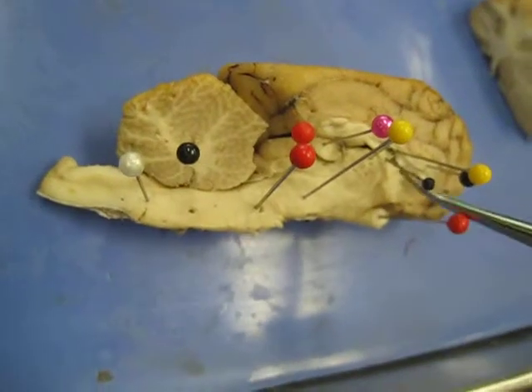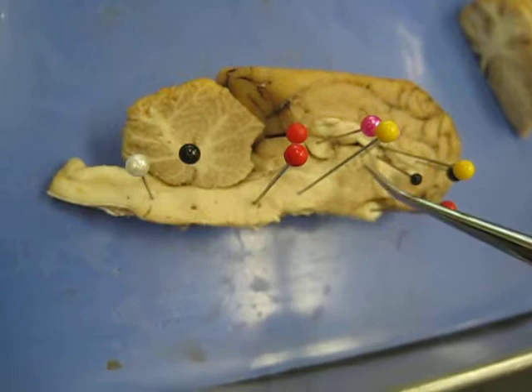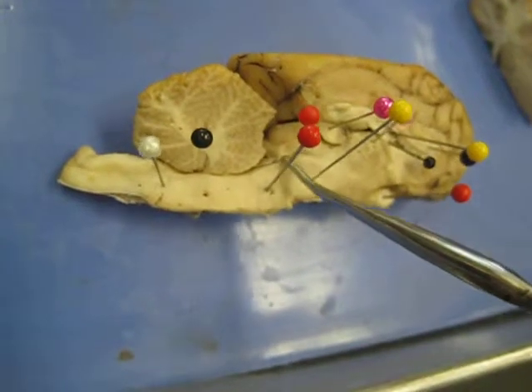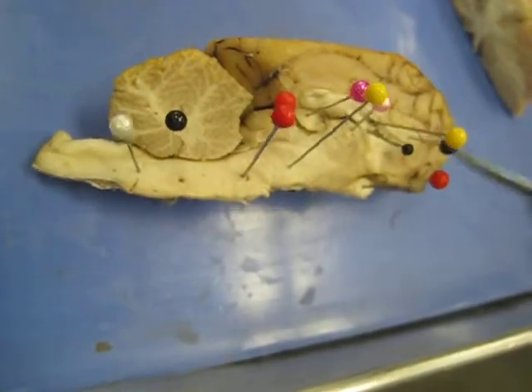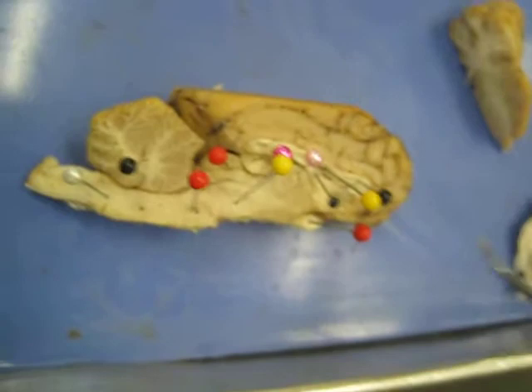You can't see it here, but you have the lateral ventricle, and then it passes through the interventricular foramen to the third ventricle. From the third ventricle, it's going to pass through the cerebral aqueduct to the fourth ventricle. I'm sorry, where's the interventricular foramen? You can't see it. Oh, okay. You can see it on that gray model thing. If I find it, I will tell you guys.